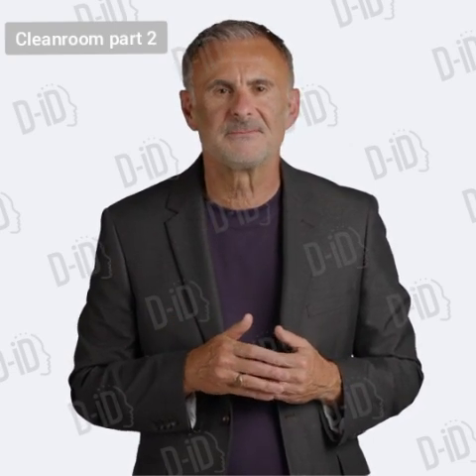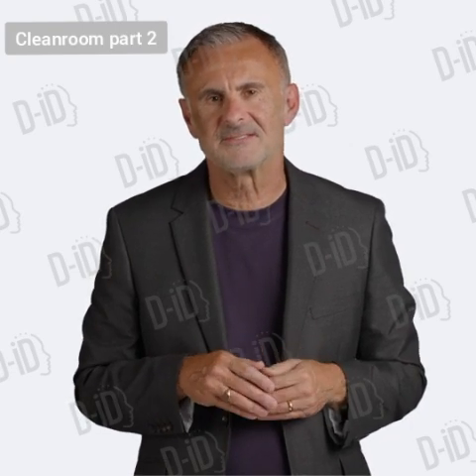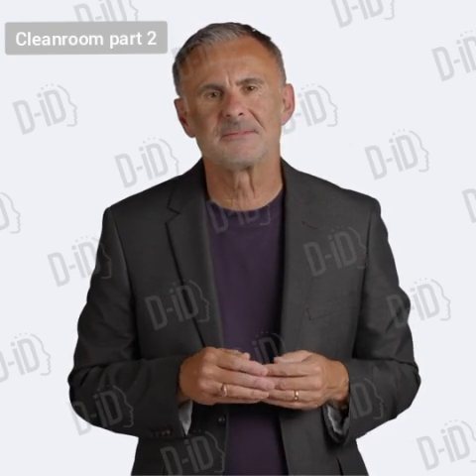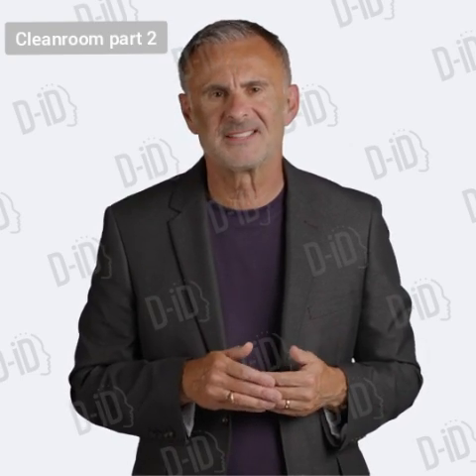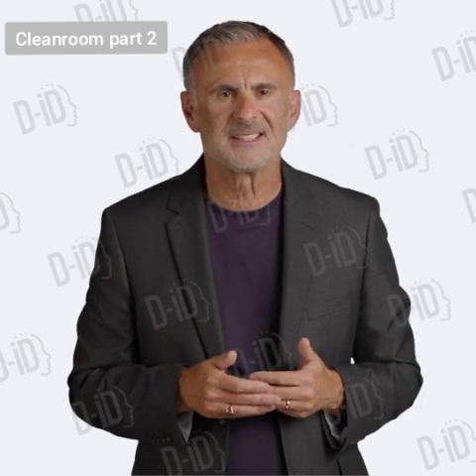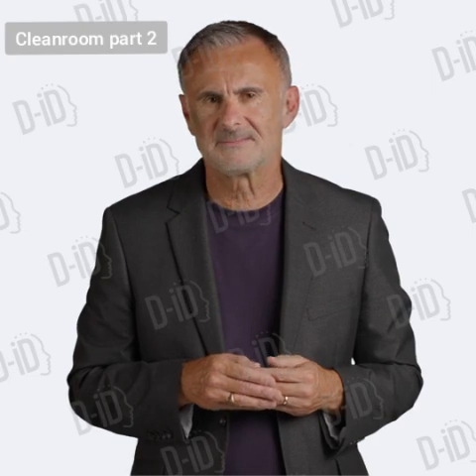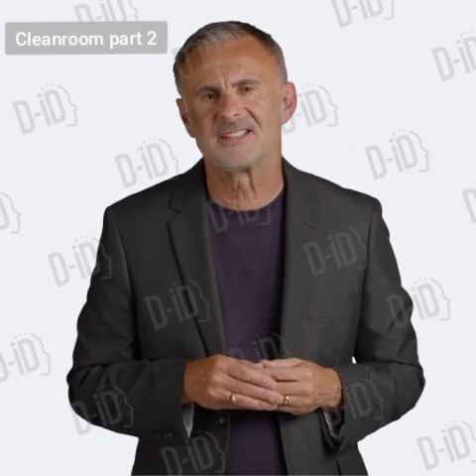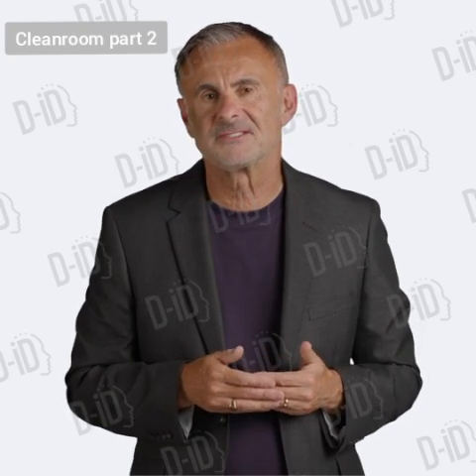3. William White, during his studies, found that a viable contaminant existed between 10 and 15 micron, and no smaller, due to desiccating nature of the dry clean room environment. 4. USP Chapter 1116, Microbial Evaluation of Clean Rooms, states that while airborne microbes are not free-floating single cells, they frequently associate with particles of 10 to 20 micrometer.